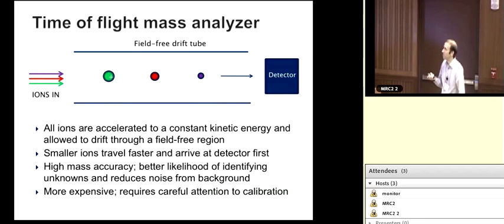And then no matter how much occurs, if you put that same internal standard in all of your samples, you know the magnitude of your suppression effect, and your quantitation goes back to being great again. We deal with this on a daily basis, and it's something we're very comfortable with. And the good news is when properly managed, mass spec can be and is extremely useful for quantitation in spite of these potential pitfalls. Okay, so now on to the fun part.